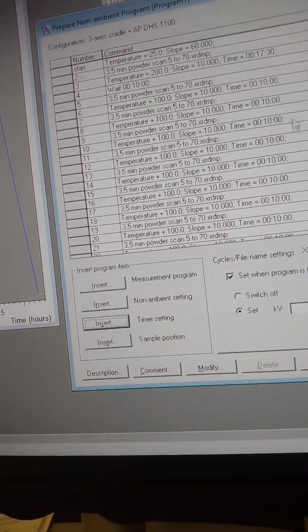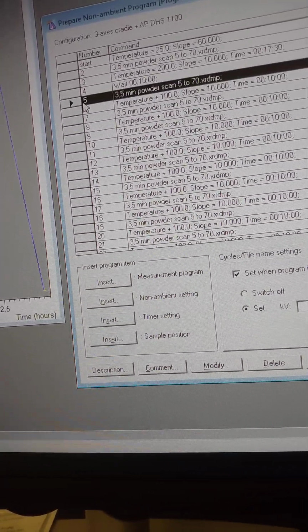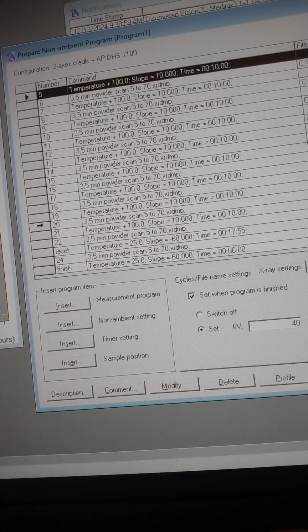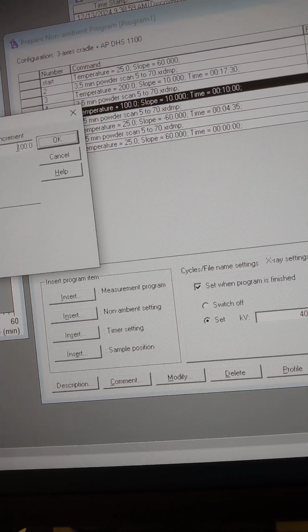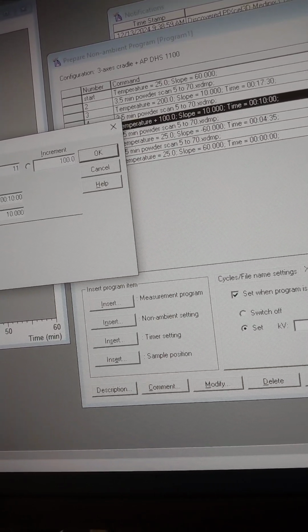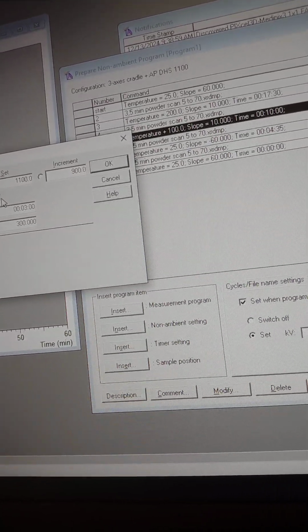You can target something. So we'll go to 200. You don't need the weight. And for this one, I actually do kind of want to drive it to 1,000. Oh, all the way. 1100. Okay. And I'm going to say go as fast as possible.